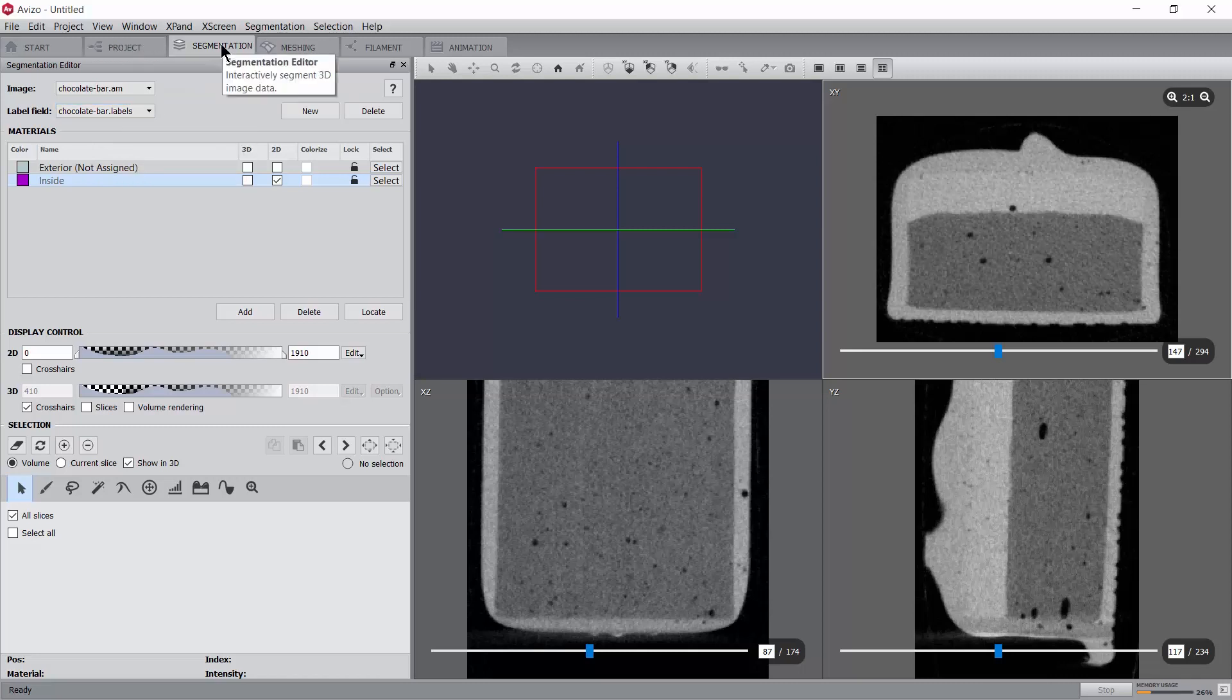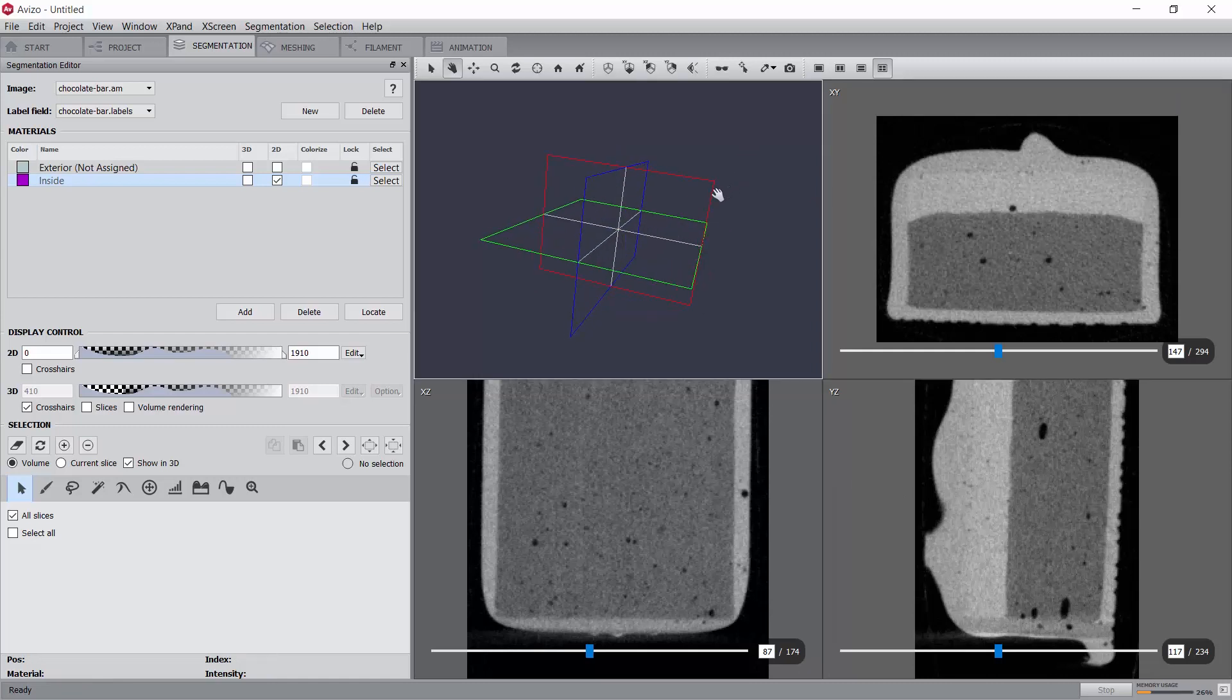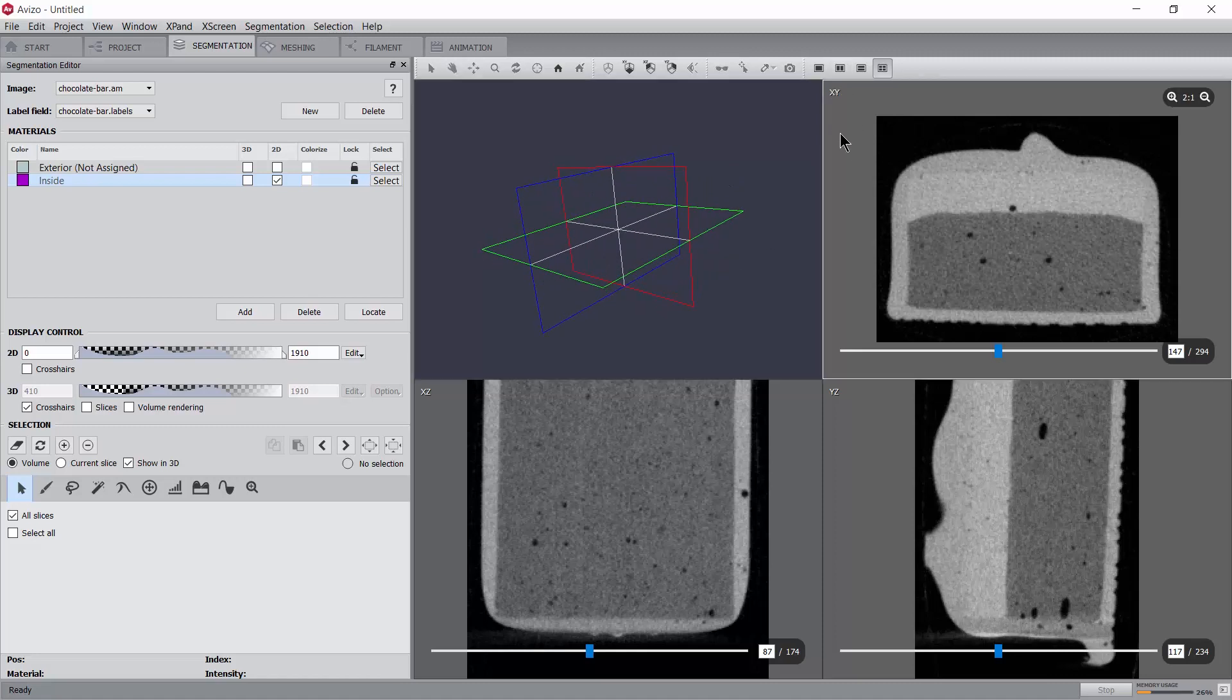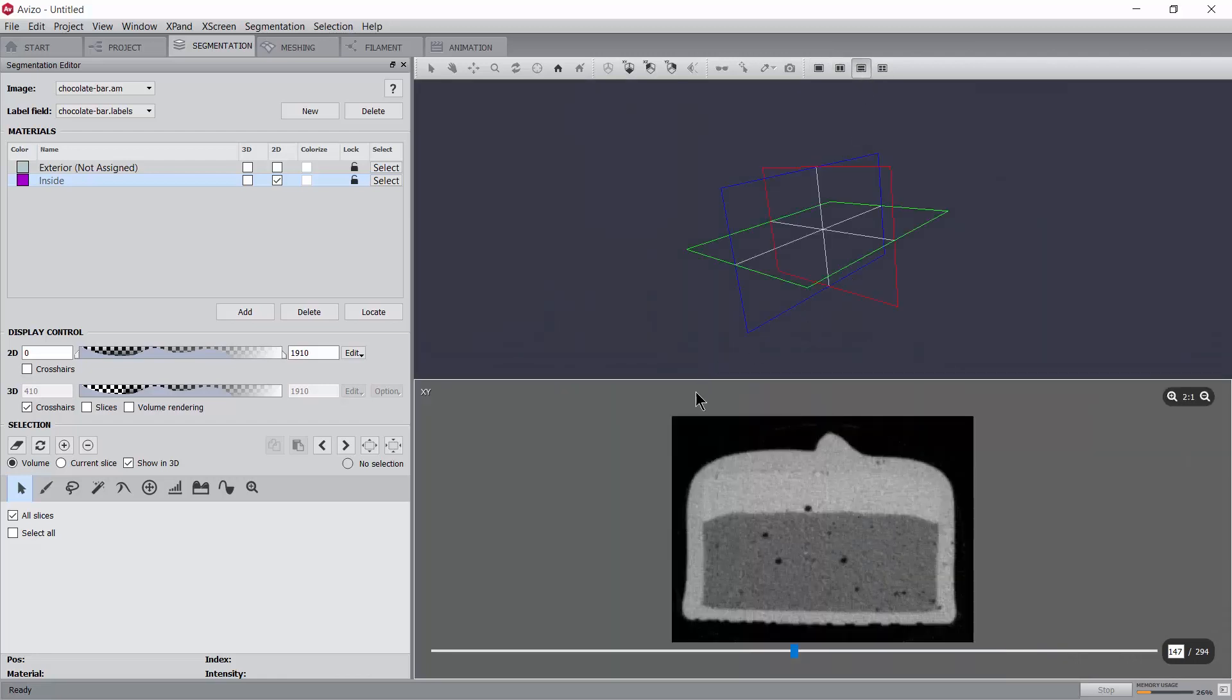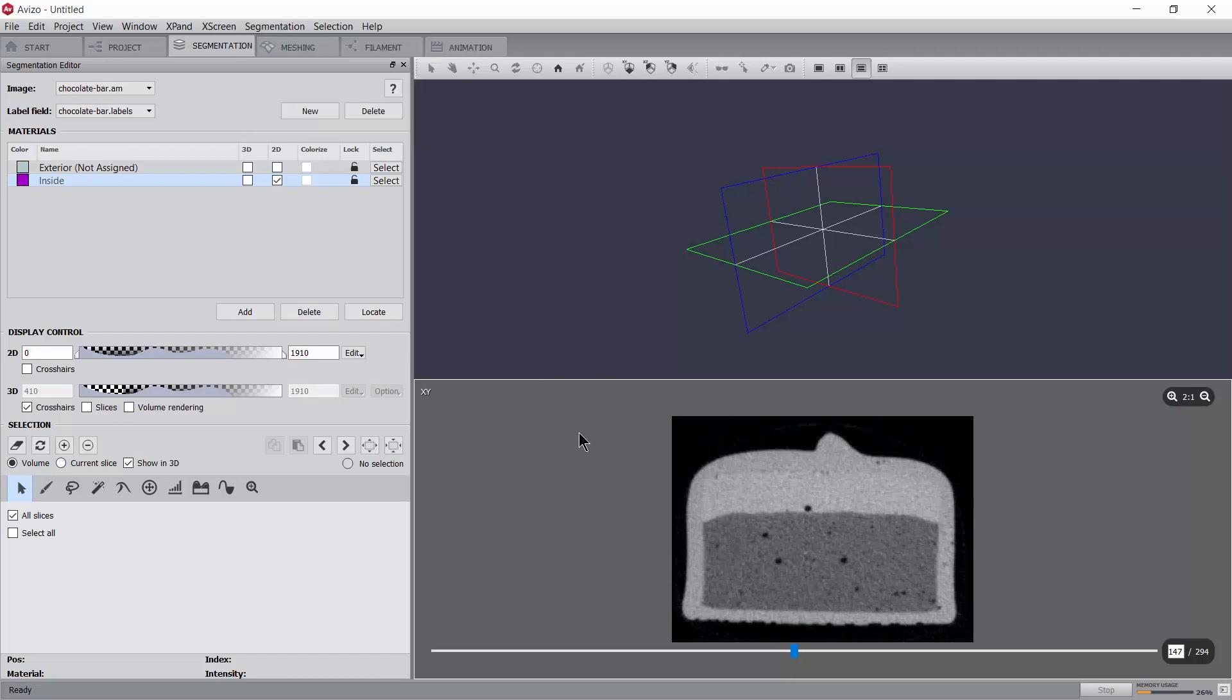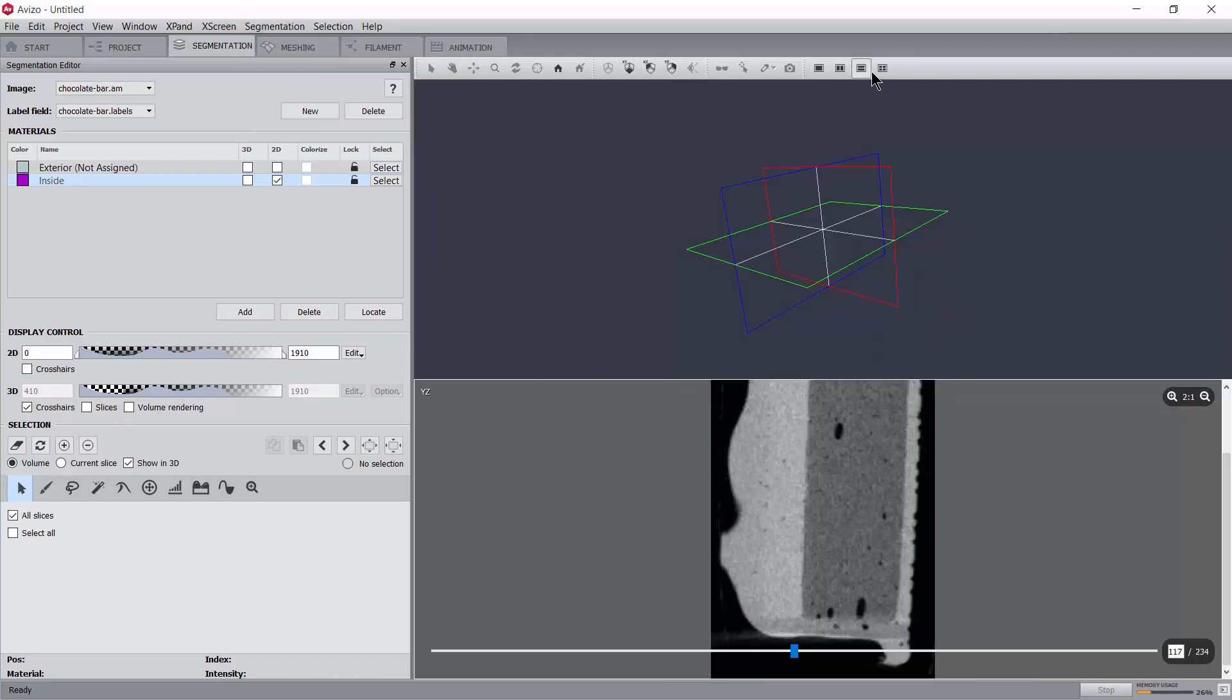The segmentation editor operates by default in four viewers mode. In this mode, three slice viewers with X, Y or Z orientations are shown together with a 3D viewer. Alternatively, single or 2D viewer layouts are possible. You can change the orientation of a 2D viewer by either selecting another orientation from the segmentation orientation menu or by clicking on the orientation presets in the viewer toolbar.